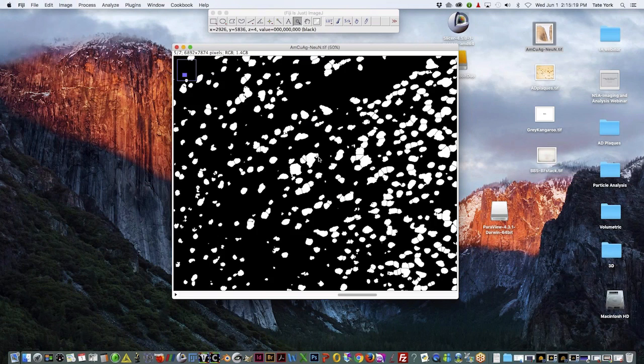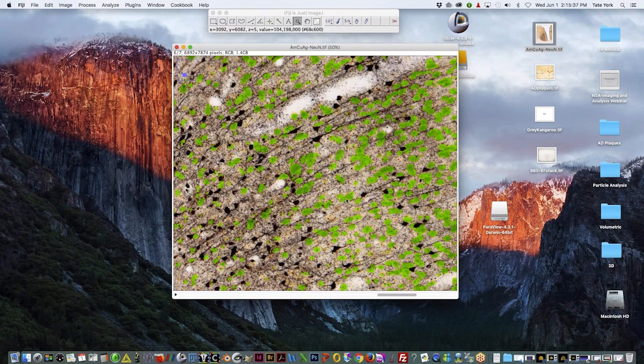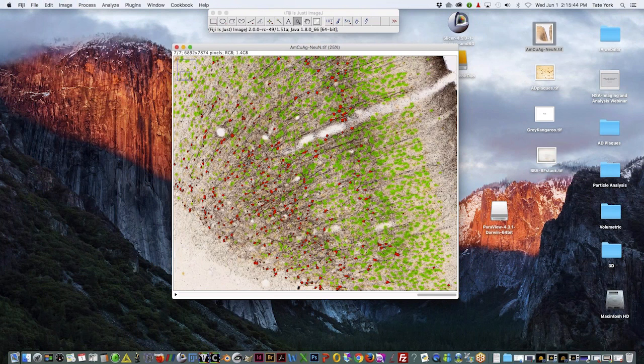And this is just a combined image showing both overlays in the region of interest. And so what this provides is a ratio of degenerating neurons versus NeuN labeled neurons in this region of interest. So you can quantify both sets of populations and compare these to one another. So you're getting a ratio in the end.